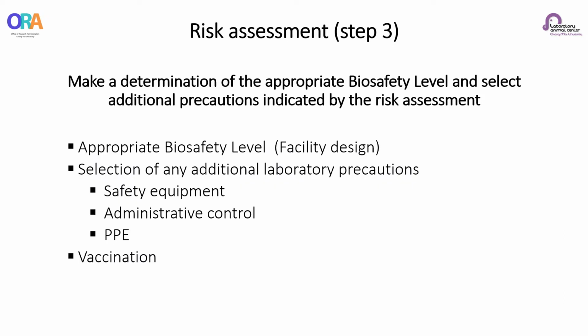Step 3. The selection of the appropriate biosafety level and of any additional laboratory precautions requires a comprehensive understanding of the practices, safety equipment, and facility safeguards, all described in sections 3, 4, and 5 of the BMBL. There will be situations where the intended use of an agent requires greater precautions than those described in the agent summary statement.